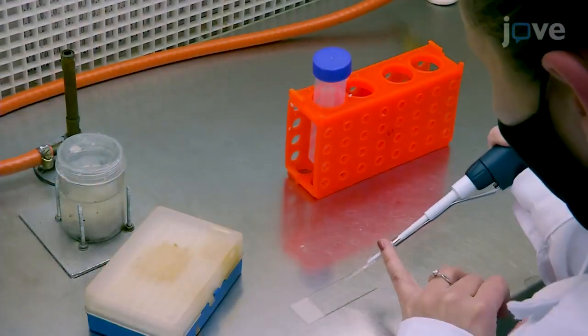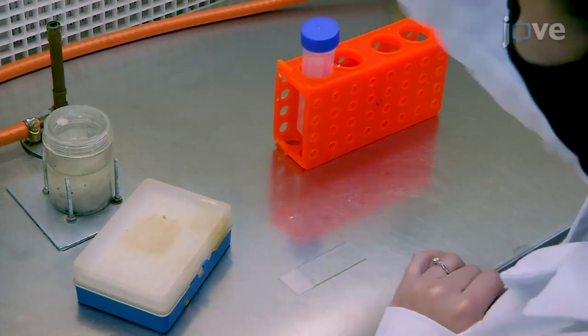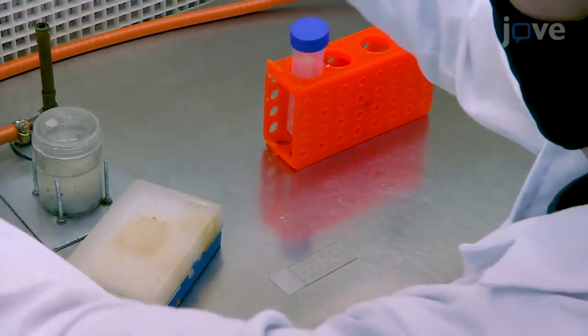Resuspend the conidia pellet in 5 milliliters of water and view a 10 microliter aliquot of the conidia solution under a light microscope at a 40x magnification to confirm that only conidia have been recovered.